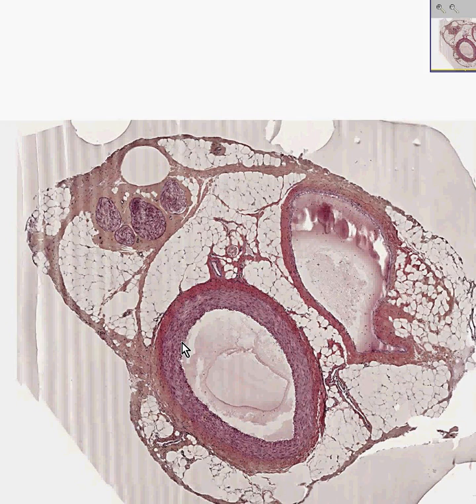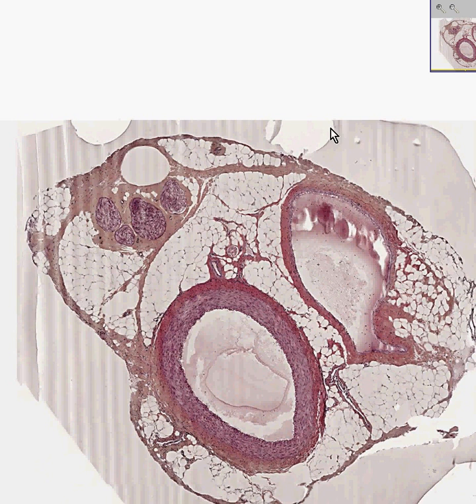This is a neurovascular bundle. Nerves travel with arteries, and arteries travel with nerves, and veins travel with arteries and nerves. So classically, what is supplying organs and muscles is not just an artery here, or a vein there, and a nerve there, but usually all three are traveling together, and they're called neurovascular bundles.